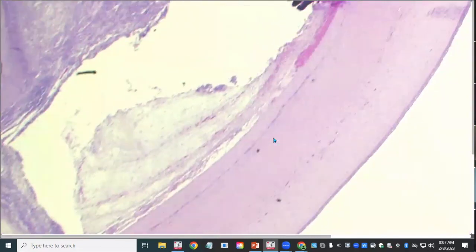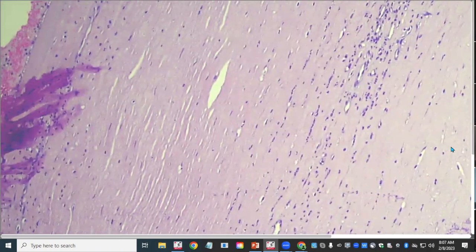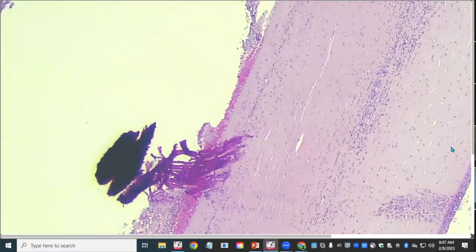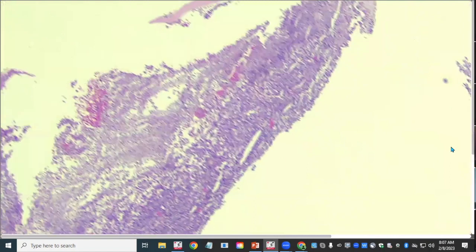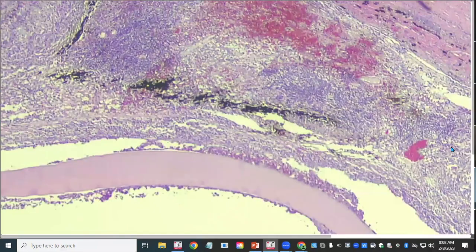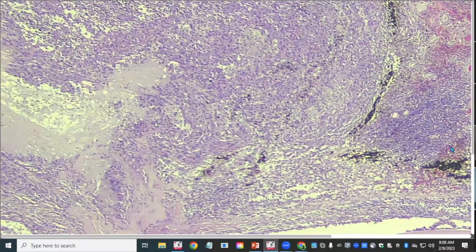At higher magnification, the cornea is really cellular — you can understand why clinicians couldn't see through it. There are blood vessels and lots of neutrophils, probably some edema. What's really relevant is all of these cells, which at this magnification look somewhat disorganized with no normal architecture.